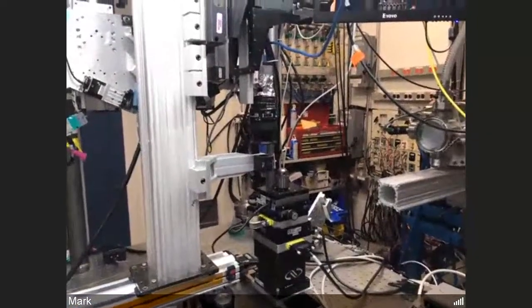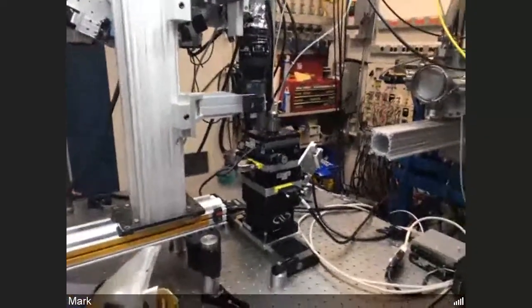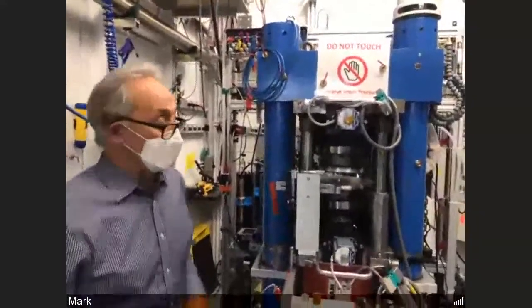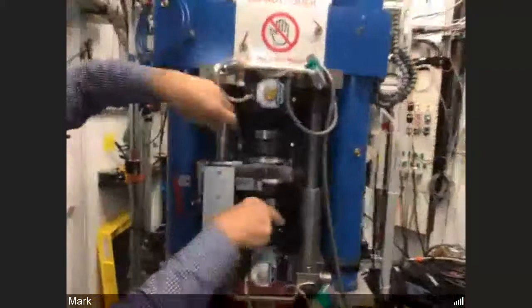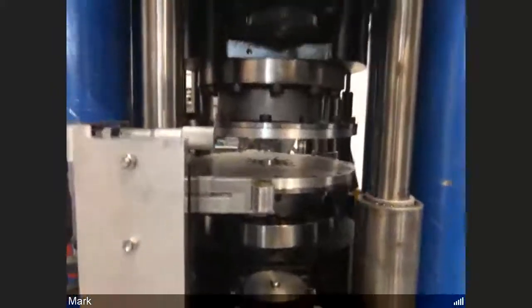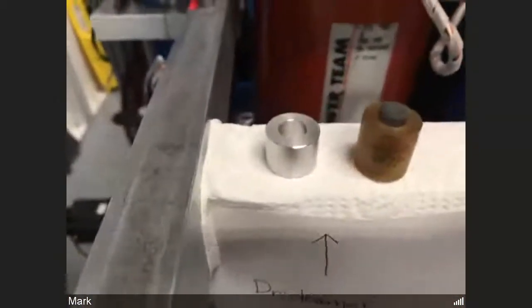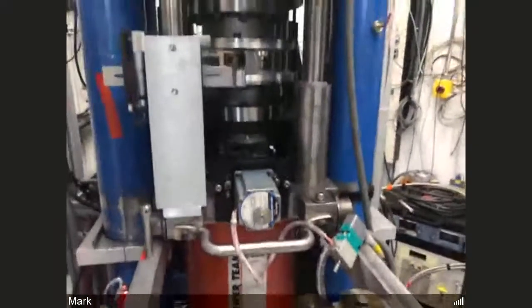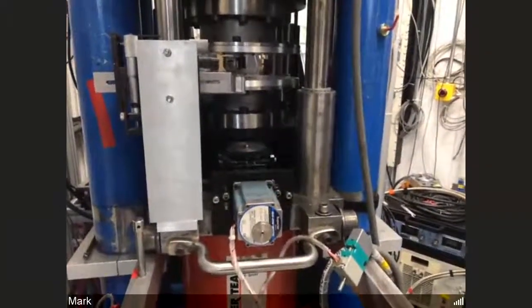What else I want to tell you about here? Let's go down and look at the 250-ton press. So this is the 250-ton press where we can do the high-pressure tomography. See these two rotation motors driving these plates here. And what goes inside that is a sample assembly. This is the one that's designed for tomography, this Drickamer cell, where it has an aluminum containing ring. And the anvil, there's a 250-ton hydraulic press here, can squeeze the sample as it's rotating.